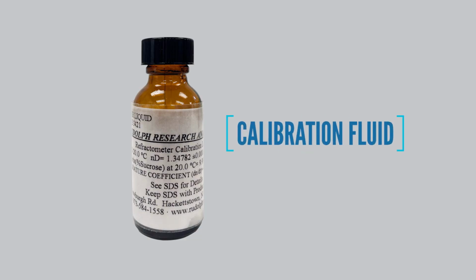We now will test calibration fluid. Measuring a sample is a good starting point, and for many smaller users, upgrading from no measurement device to having one is a significant step forward. However, the next crucial step is ensuring that the measurement device is functioning correctly, which involves considerations like ISO standards and calibration. Let's take a closer look at what happens when we measure a calibration reference fluid.